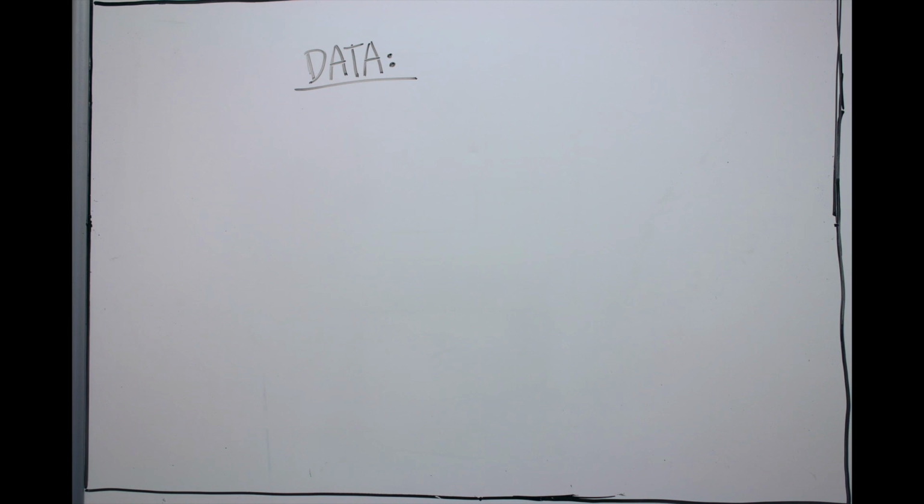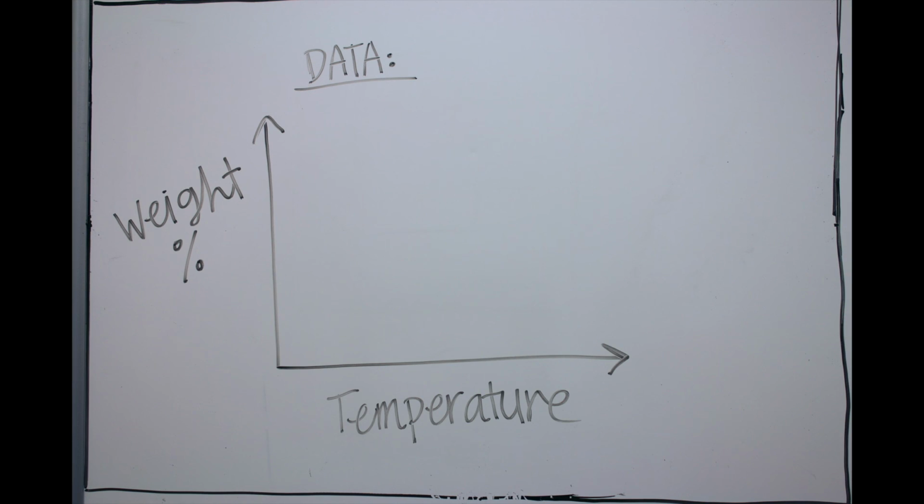The data from a TGA test allows researchers to easily visualize how the sample responded as temperatures changed, which gives them a good understanding of the material's physical and chemical properties, such as the compositions of what materials exist, what this material could withstand, and how it will react to different conditions.